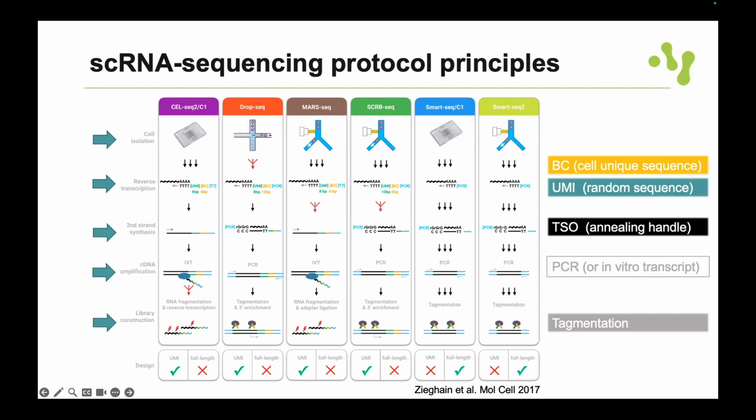Okay. So I think it's that combination with whatever maps into the gene also that makes it almost impossible to have 2 copies of the same. I see. Okay. And you also have a cell barcode, so it should be on the same cell, on the same gene, as was said. Cool. Thank you.